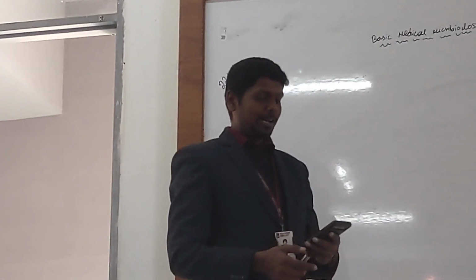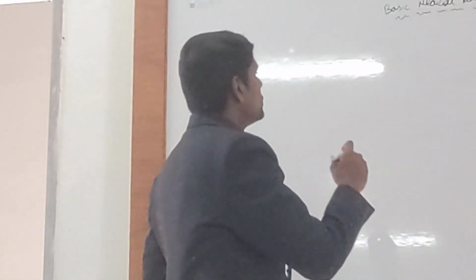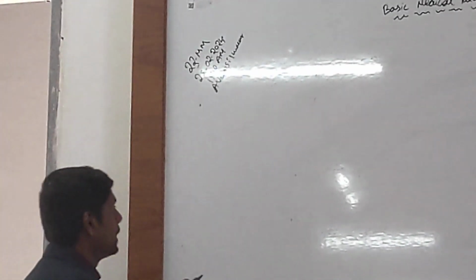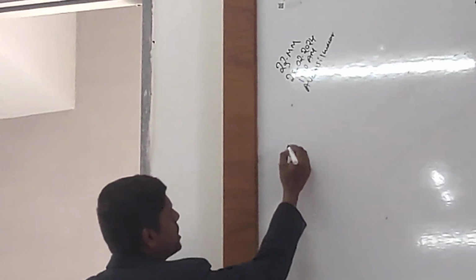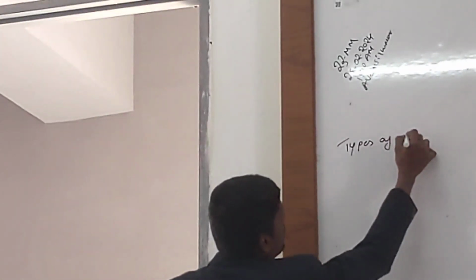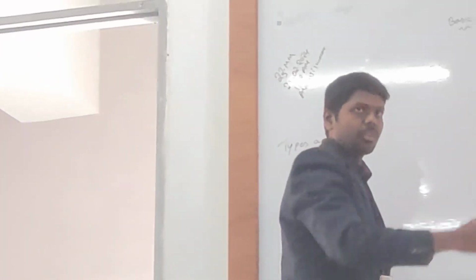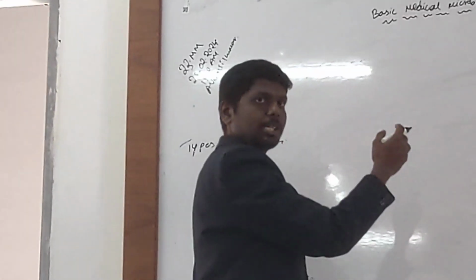Anyway, I will try my level best to understand microscopy. So first of all, you should know a few important things: types of microscopes. I think I will draw the classification. Everyone go through this one.